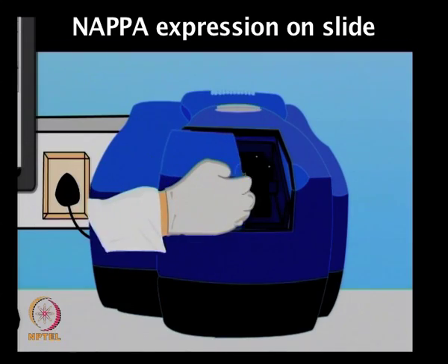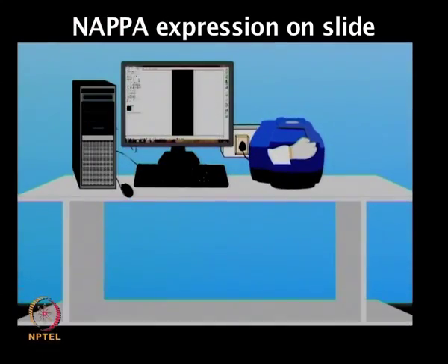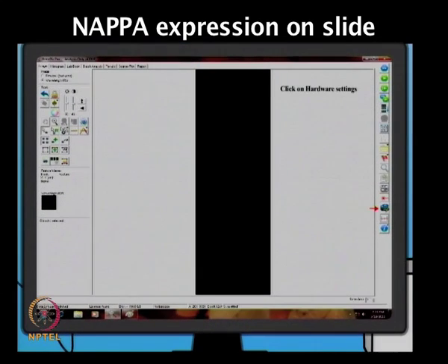There are different types of scanners available, including automated ones, where multiple slides can be scanned in an automated way.